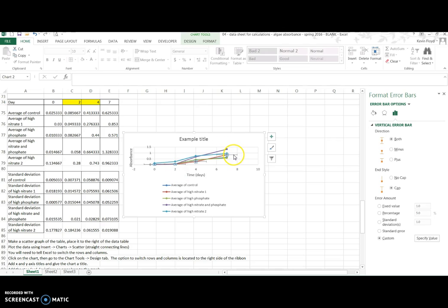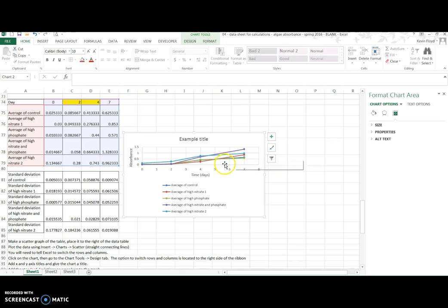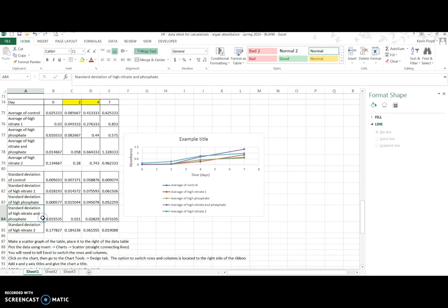And same thing, we have these X error bars to get rid of. And again, you can barely see, if you look really carefully right there, you can see a bit of the error bar. Again, because the errors are relatively small, the error bars don't show up that well. I'm going to go ahead and do the rest of these error bars and then come back to meet you.